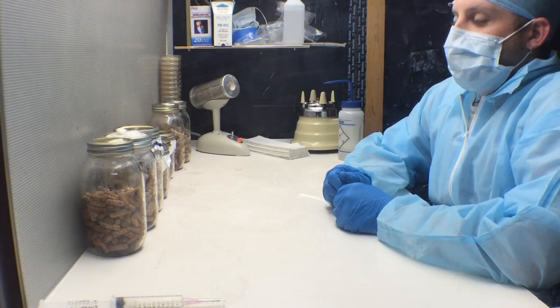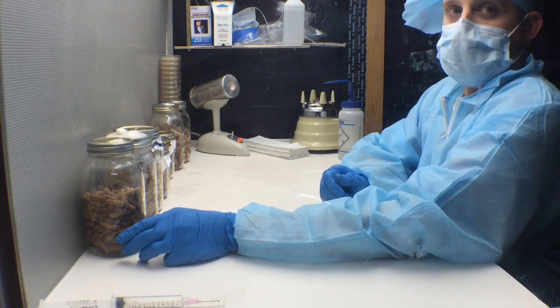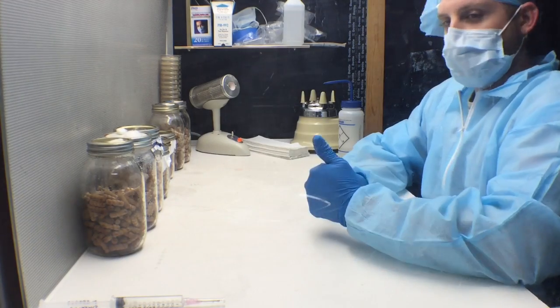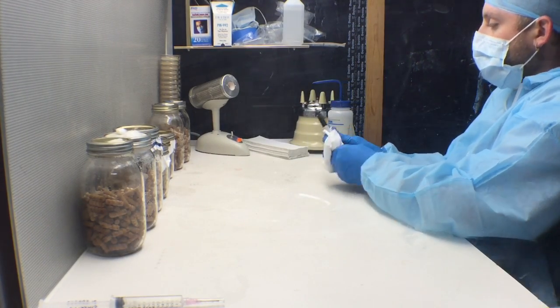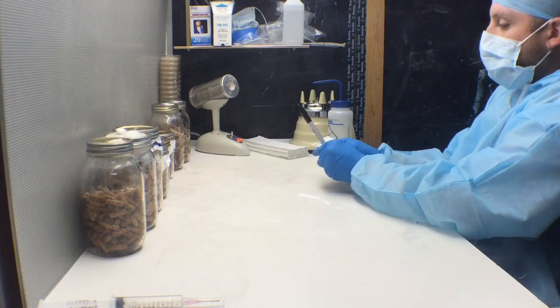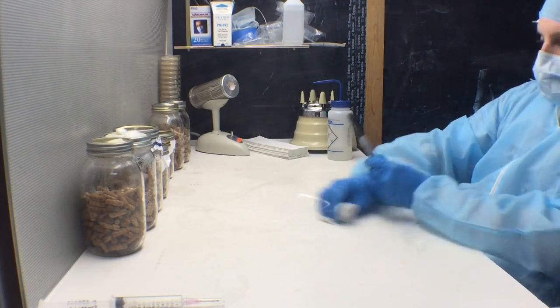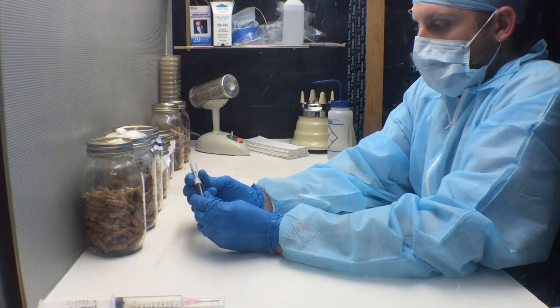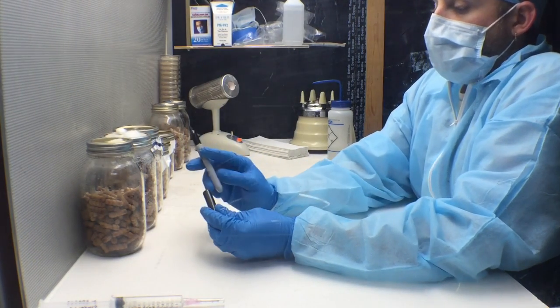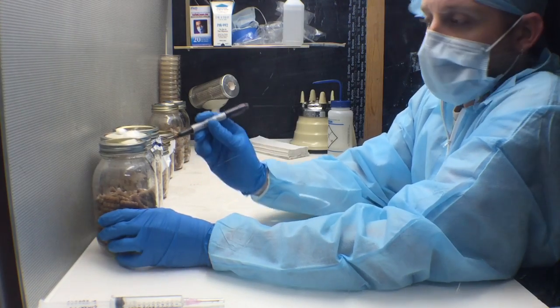Now your jars are sealed and you should be able to take them out of your clean area and put them into your inoculating room. The next step will be to label all of your jars. In keeping with clean technique, we're going to sterilize our pen and then put our information on each jar so we do not forget when we made them and what culture we're using.